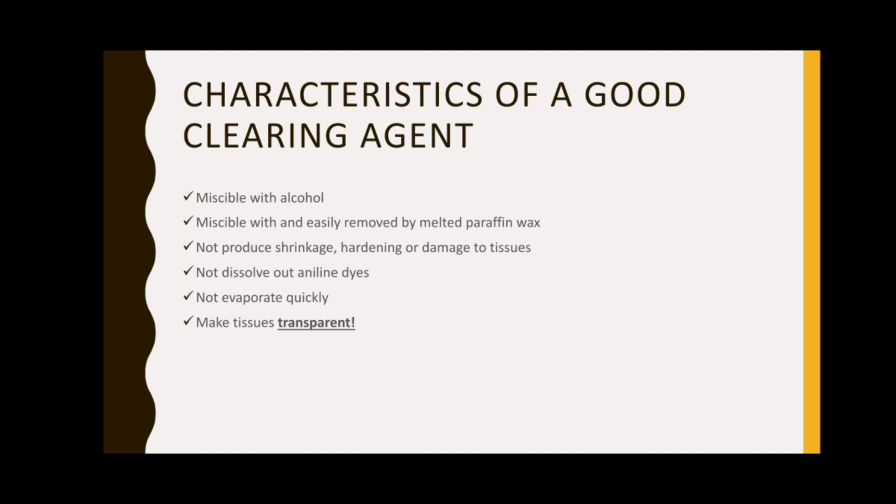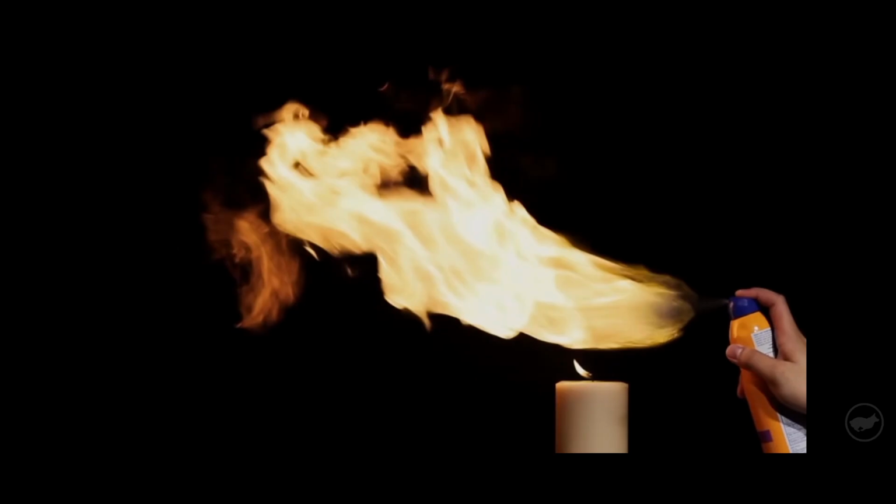It should not produce excessive shrinkage, hardening, or damage of tissue. Not evaporate quickly in a water bath. It should not also dissolve out aniline dyes. And of course, it should make tissues transparent.